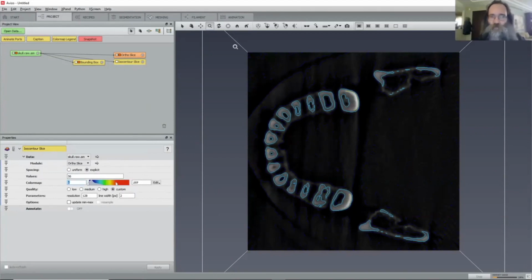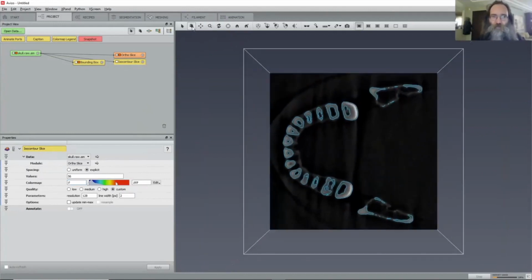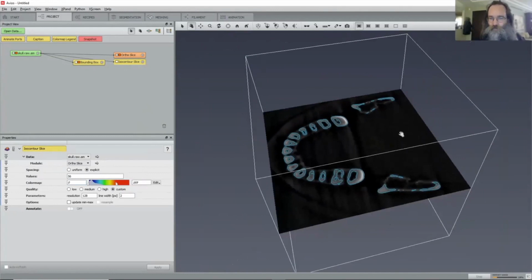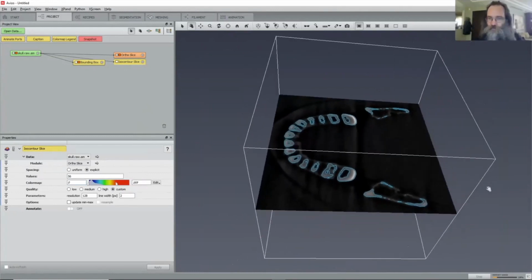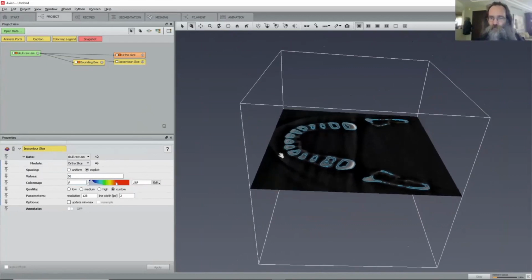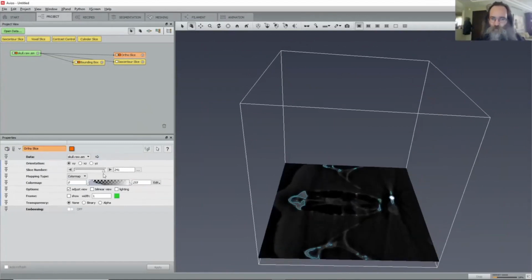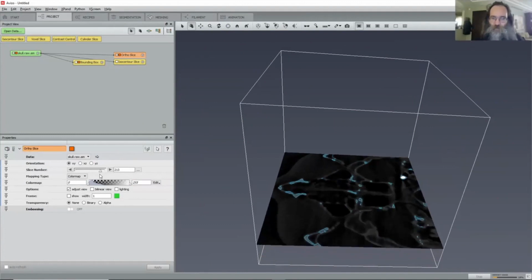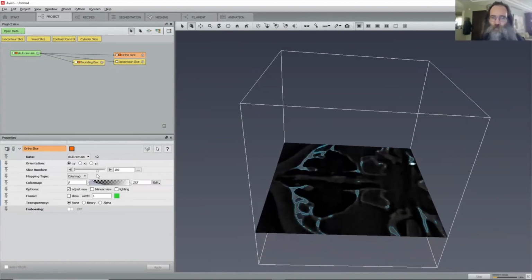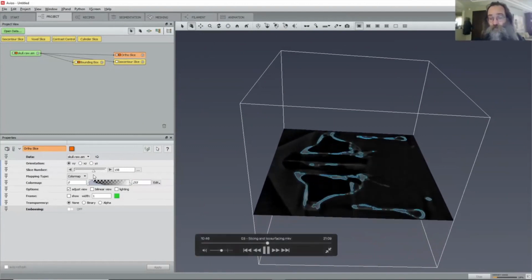And let's try to, again, visualize how the 3D object would look like. If we slice through the data, like this, from bottom to top, the contours on the slice, as we sweep through the 3D space, will sweep out the surface, which will be a 3D object that should look like a skull.